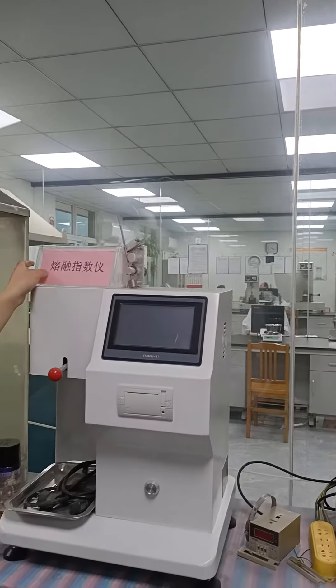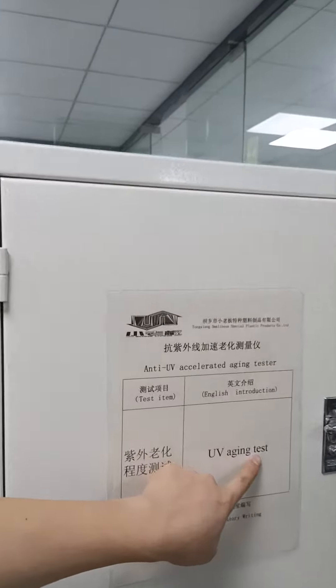Yeah, this is the same. And this machine is for the UV aging test.